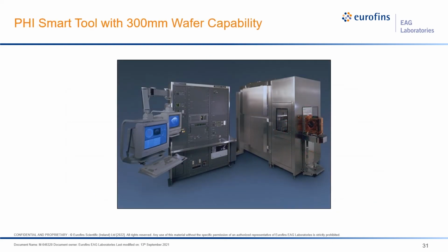So before we begin with the full wafer particle analysis, I'd like to show our best full wafer Auger system that produced these results. This instrument is in our Minnesota laboratory, and it has 300 millimeter wafer capability. We can take a full wafer cassette from our clients and introduce them into this Auger system without exposing them to normal air, providing many more particles if we do that. The system has the same features that the earlier instrument I showed you has, except the vacuum chamber, of course, is much larger to accommodate the much larger samples. And we're hiding all the cool stuff within these steel enclosures to give it this nice, clean appearance.